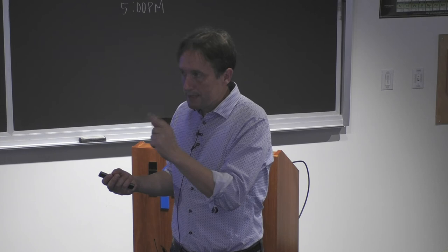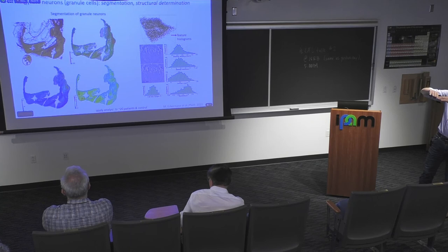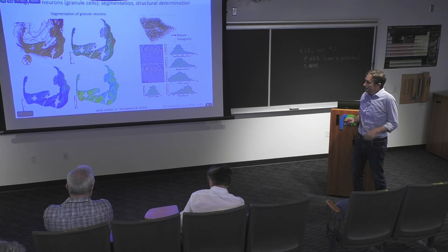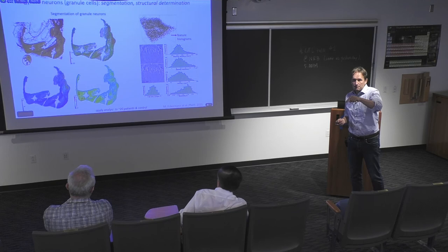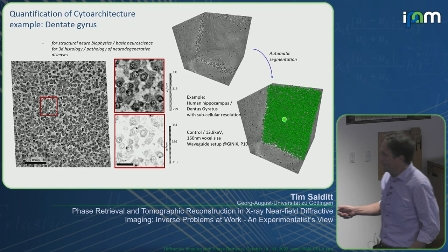What are the main modes? But this requires metrics and a representation in a patient space that is not a priori linear. So we have to define a barycenter and linearize in a space that is constructed from optimal transport metrics. We can then locally linearize and do PCA and see where are the changes. And only afterwards we can put in the clinical staging and say, okay, this is the control and this is the Alzheimer group. The first step to do this is, of course, to segment the gray value data to really have individual annotated nuclei, yeah?